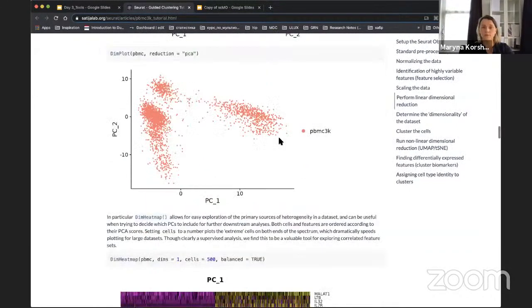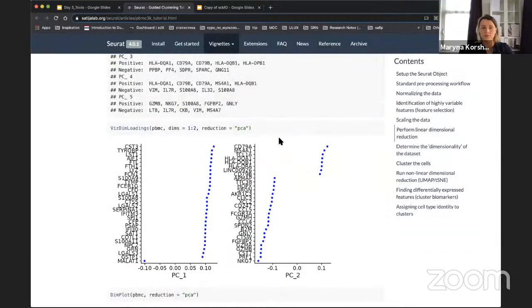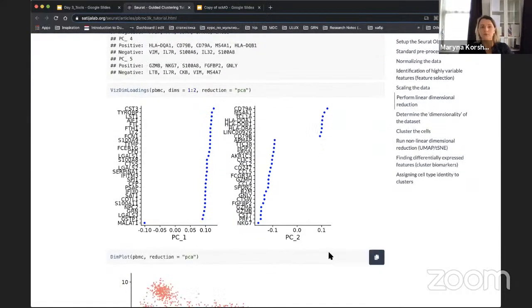The first step of the dimensionality reduction is principal component analysis, and it can also provide you the understanding of the most influential factors, I mean, the genes which influence the variability in your data set the most. That is why you do, first of all, the principal component analysis. However, you can also apply canonical correlation analysis and other statistical approaches, which will do the same.